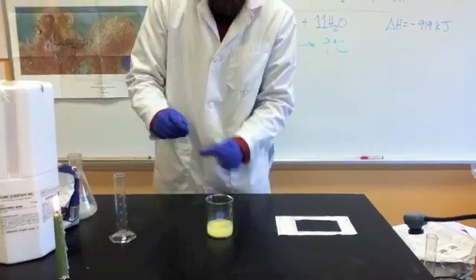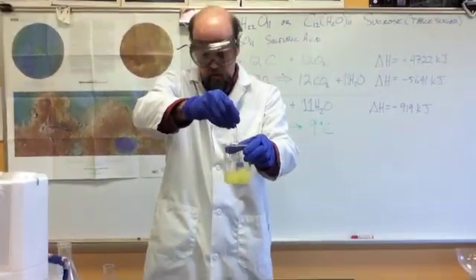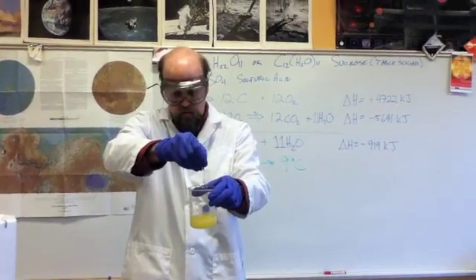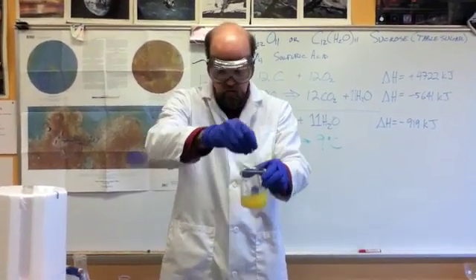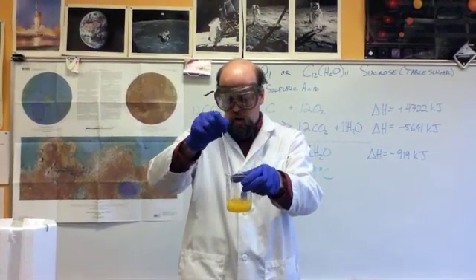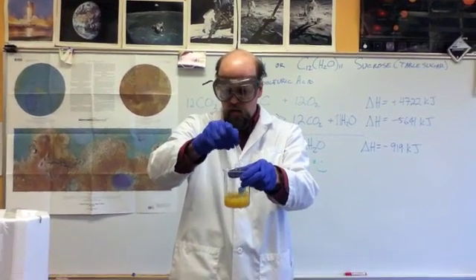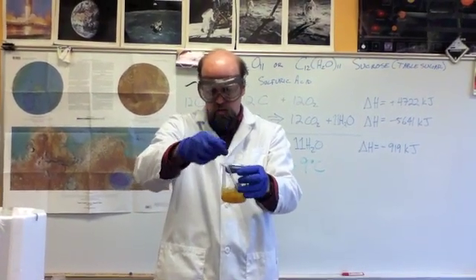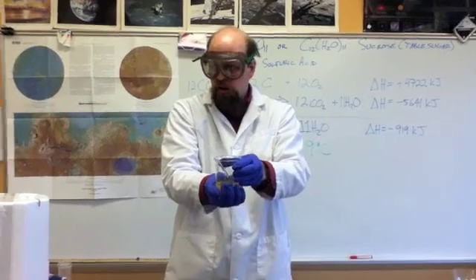Now clearly something's happening. It's turning yellow and we're going to let the color changes happen here. It's dehydrating the sugar. It's taking the water away from it which is diluting the sulfuric acid and releasing some heat.